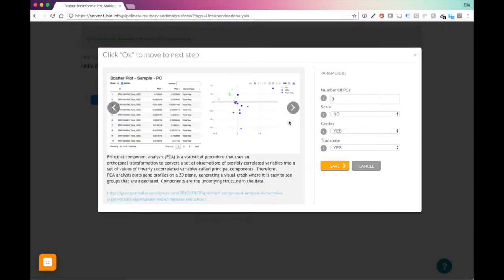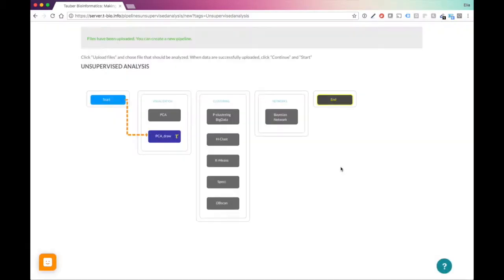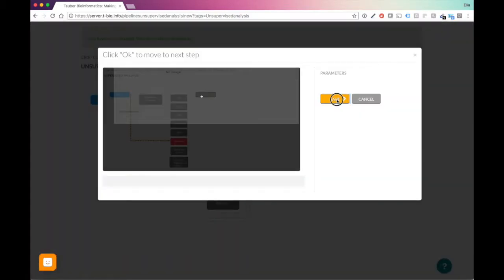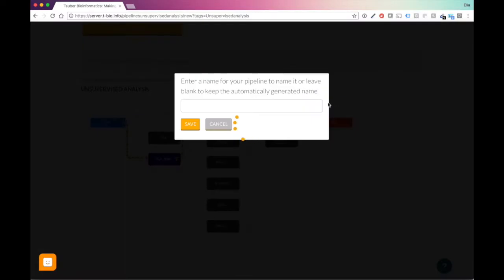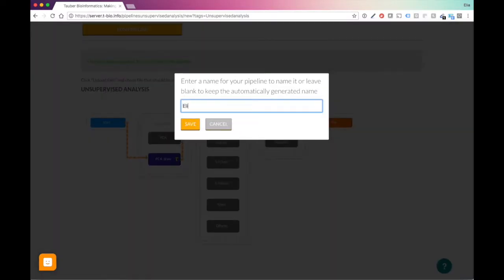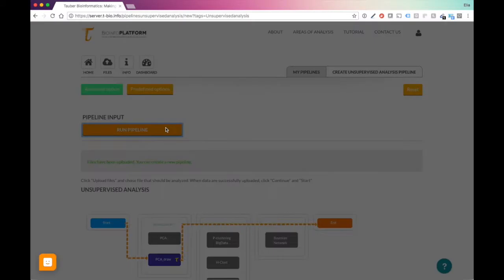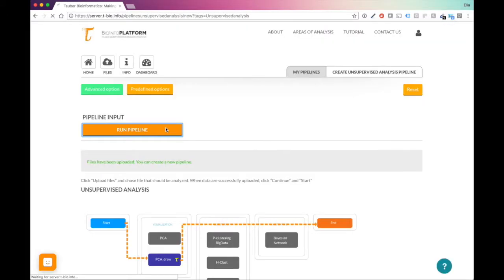We'll choose PCA Draw. Now, if you remember in the previous exercise, what we did with PCA is we generated the full PC table. We had a bunch of different PCs and we selected only two. So we can do three or we can just even change it to two. We don't want to scale, center, transpose, yes. Let's go further, do end. I will just do Ilya PCA, run pipeline.